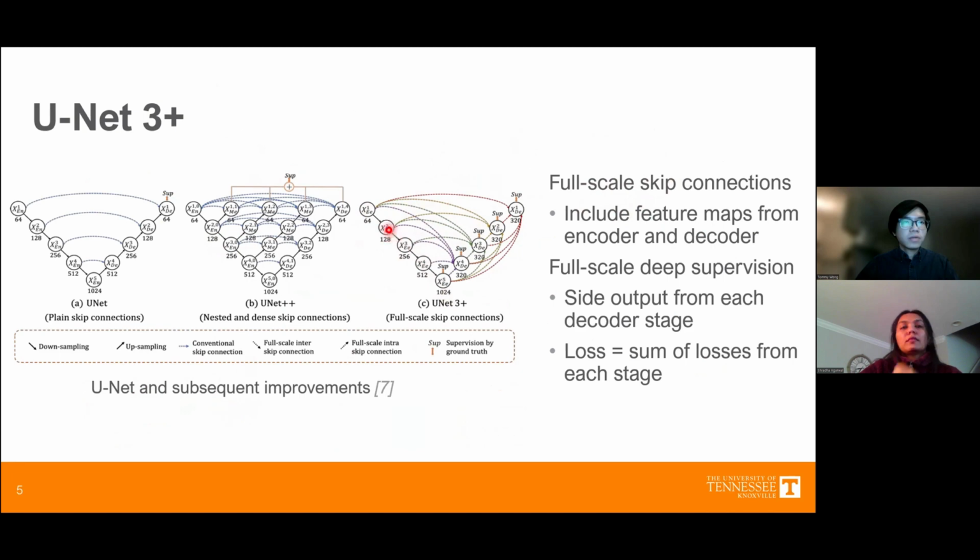So data could bypass deep layers of encoders to the decoder, but it also allows skip connections from within the decoders itself. So it could incorporate data of various scales, from the finest of scales in the middle of the UNet to big picture information, in both the encoder and decoder.